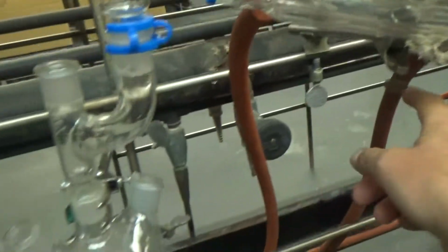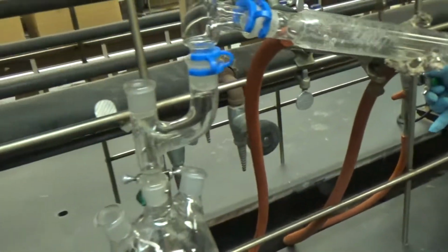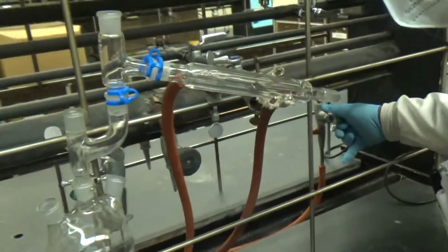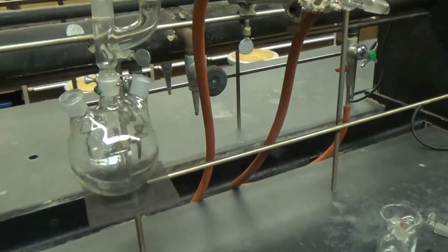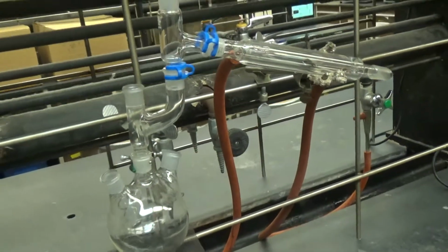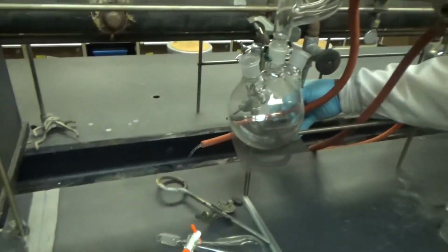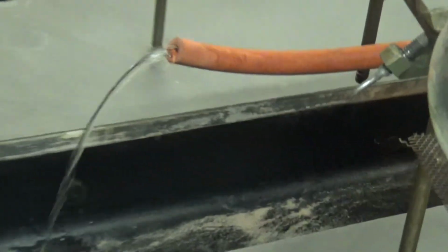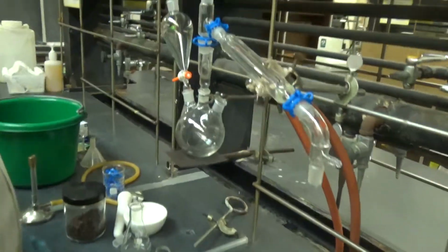And you have water that's going to come in from the bottom. Be very careful. That's the first thing you do. Gently, just a little bit of water. Okay, the water is circulating now. In at the bottom, out the top. We see water flowing out the top. Alright, so there we go. There's the basic setup.